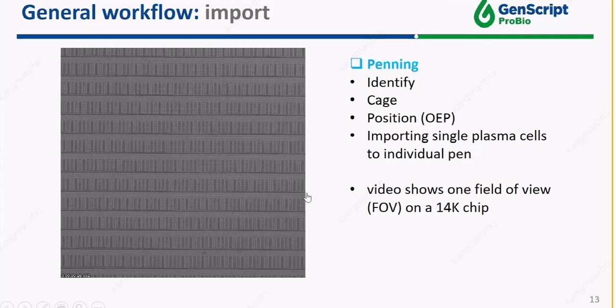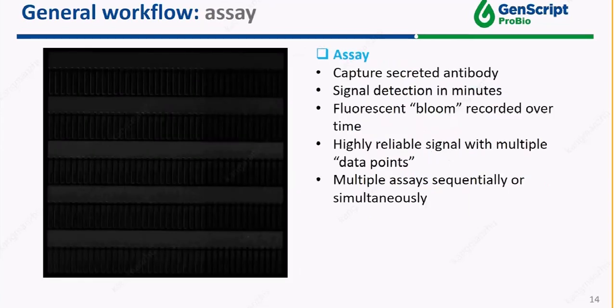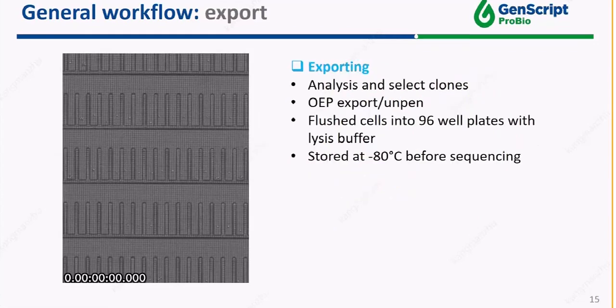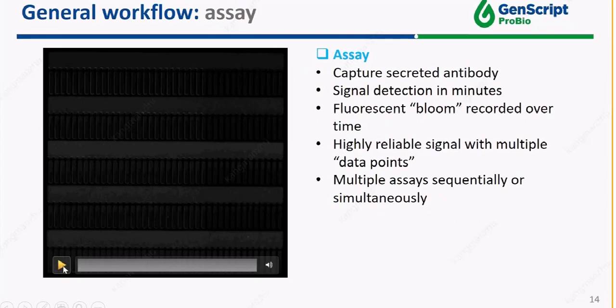Okay, so here you have the cells that are being penned into the nanopens. So next, after the cells are imported or penned, we start the assay. I'm going to go back and play the video for you as well, so you know what I'm talking about.